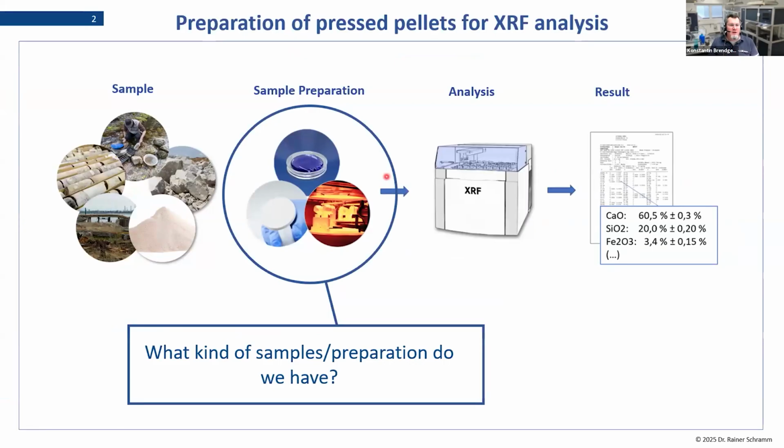For those of you who are familiar with our usual layout of these applications, we usually go over these 4 steps. We talk about the sample, the preparation, the analysis, and the results. Today we will only focus on the left side. So we'll start with the sample preparation this time. We'll do it a bit out of order today.